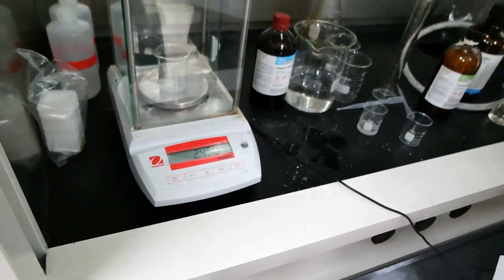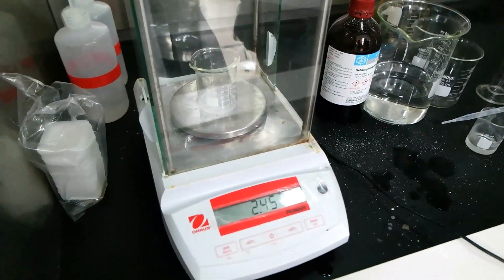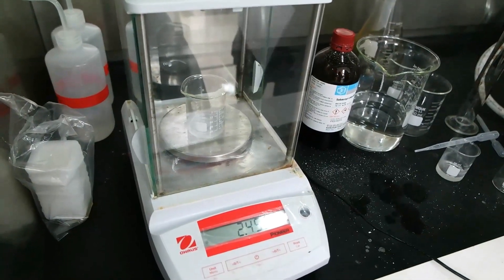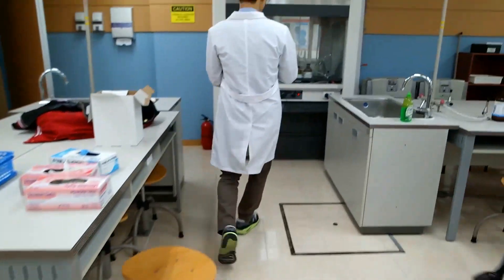We need to add 0.4 grams of sodium hydroxide — pure NaOH. Let's run to the storage room. Here it is. Like a really proper procedure.